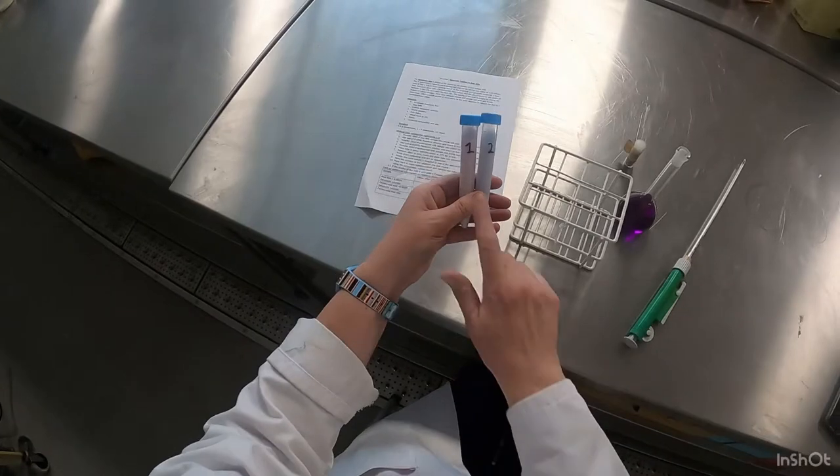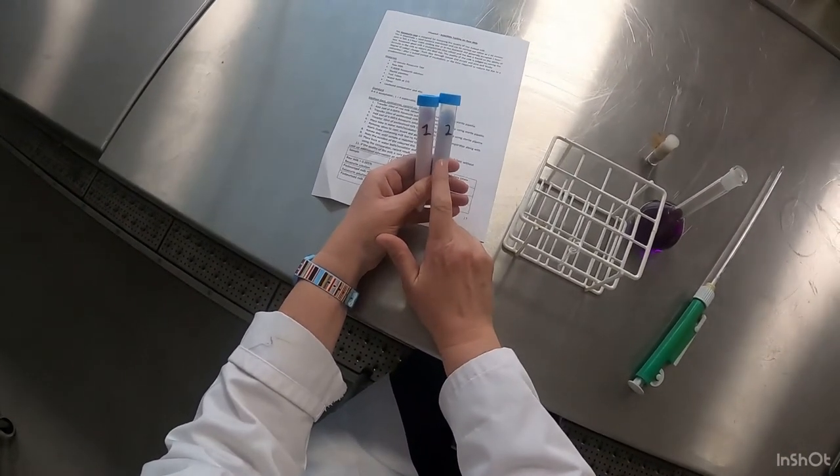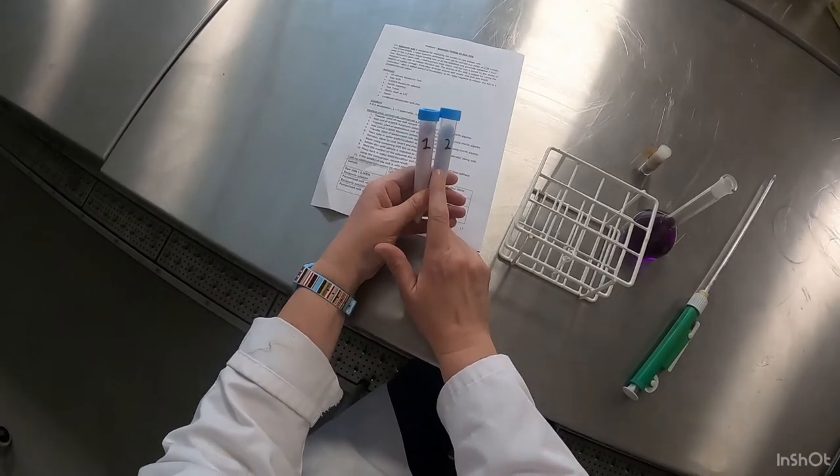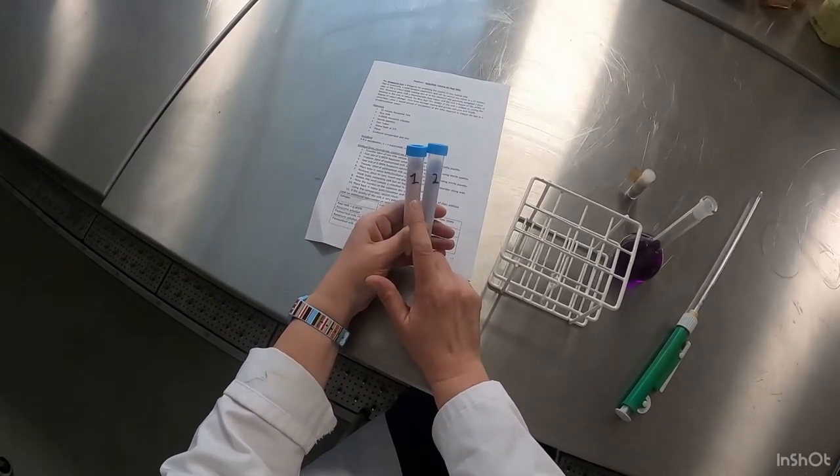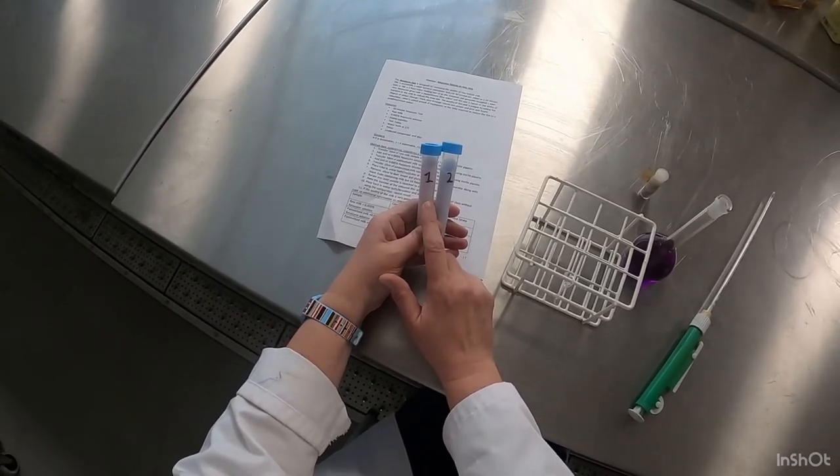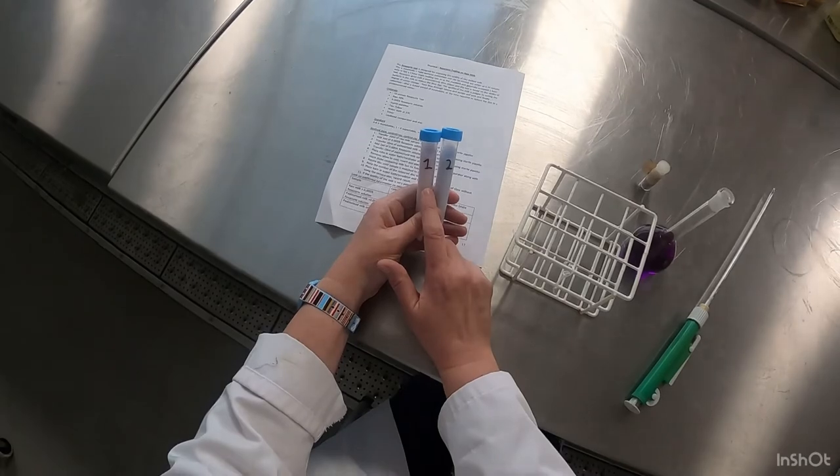As you can see the big difference here, sample 1 has changed to a pink color and sample 2 still remains the blue color as it was in the beginning. Because it has changed color, there must have been some bacterial activity in the sample that caused the color change.